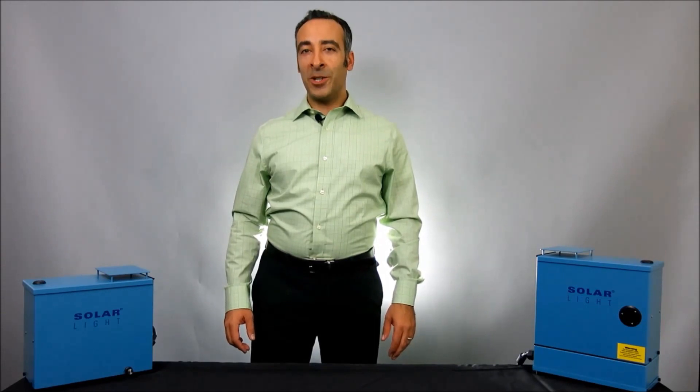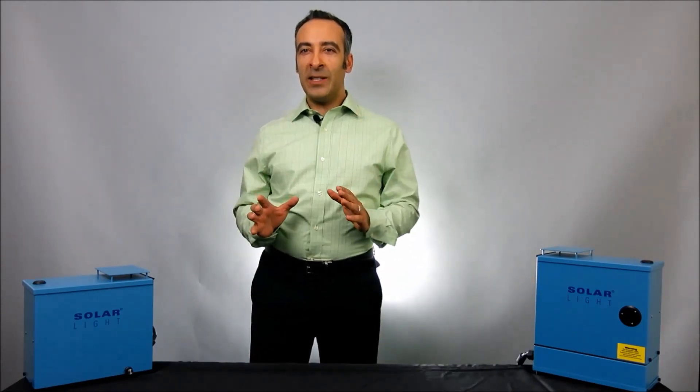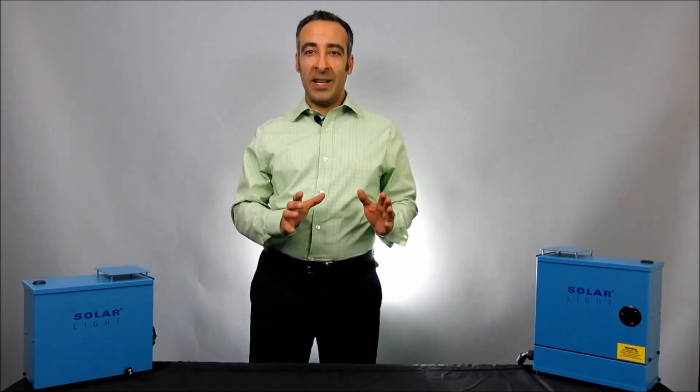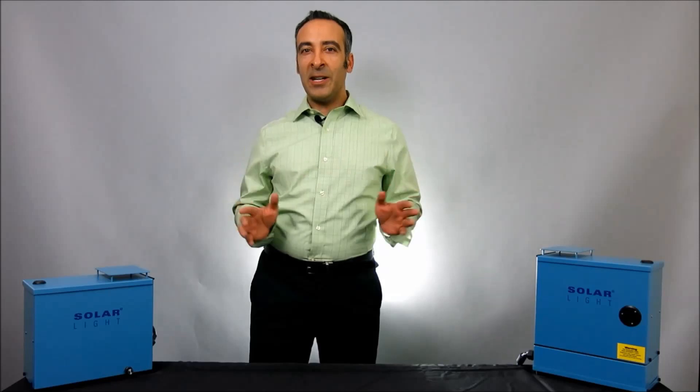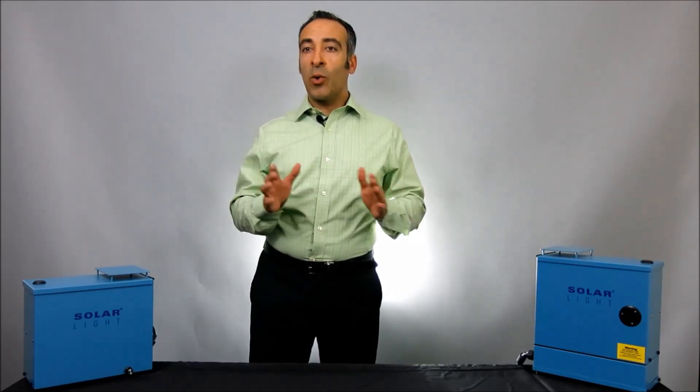Hi, I'm Moshe Levy, Vice President of Marketing at Solar Light Company. Solar Light provides accelerated UV testing services to simulate the effects of sunlight and artificial sources on textiles, plastics, and just about any other material that fades or degrades in some way when exposed to indoor or outdoor light.